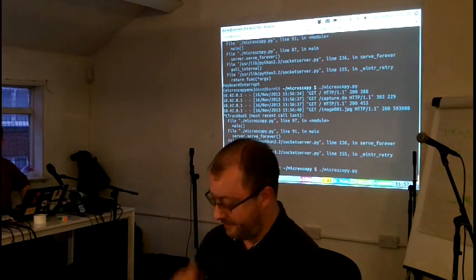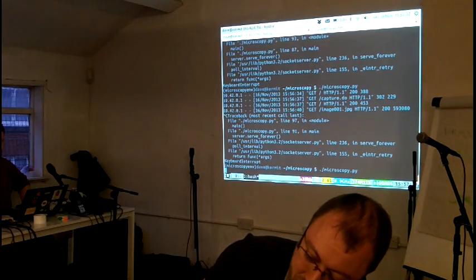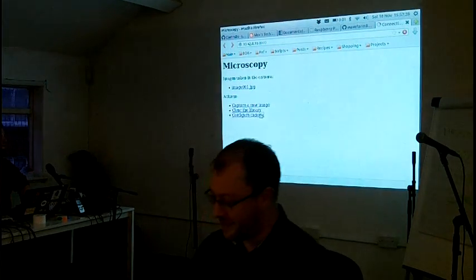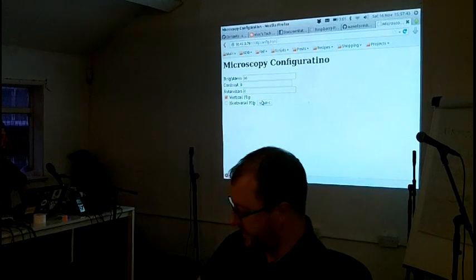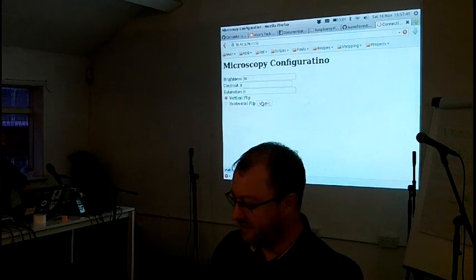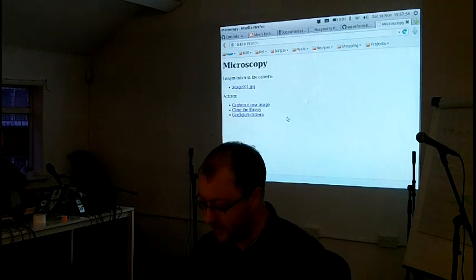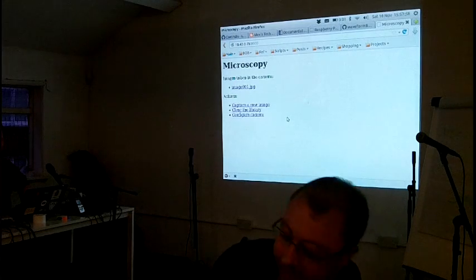So let's try running that. Let's see when your lovely visage appears on the screen. Okay, you're not there. Just give me a second. We're going to configure and see what we can see. So we're in configure. Now what happens if I just vertical flip? Yeah. Are we the right way up? Yeah, excellent, we're the right way up. Brilliant. Okay. Can we get you even the right way round? Because you're probably backwards at the moment. And we're hopefully the right way around as well. Ah, there we go, yeah, more or less.